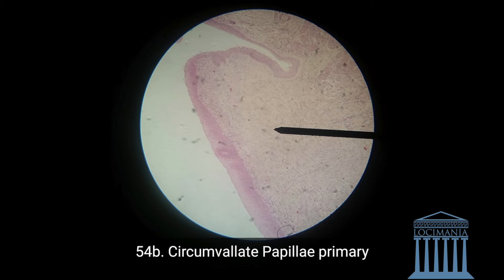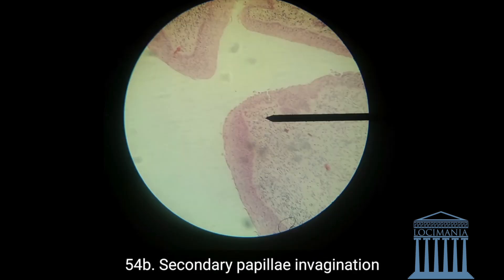So what exactly is the secondary papillae? Well, it's just the invagination. It's not the whole strawberry — just the invagination, as you can see here. It is the connective tissue that invaginates on the wall.